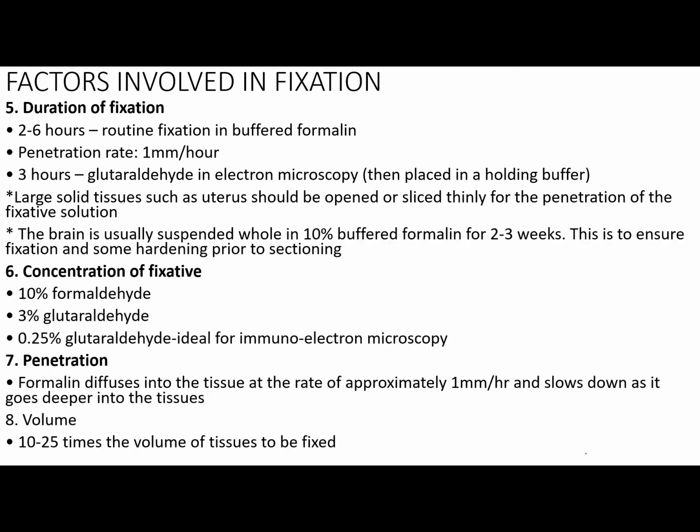Then we have to consider also the duration of fixation. How long should you fix the tissue or the sample? If it's routine fixation, class, in buffered formalin, you should allow it to be fixed for 2 to 6 hours. Then take note, class, that formalin penetrates tissue at a rate of 1 millimeter per hour. Then if you're going to use glutaraldehyde in electron microscopy, it has to be fixed for up to 3 hours.